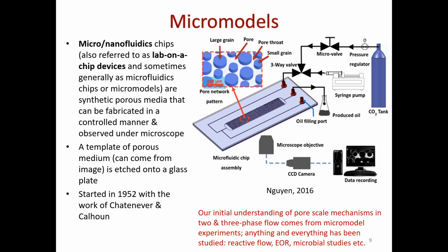It does take a moment to produce one. And you have to be in a clean room because these are very small sizes. The depth of the etching depends on how long you expose. And then you have to seal your micromodel on top. But altogether that could take about 10 to 12 hours. So if you're thinking of signing up for a research project like that, have that in mind. But then you can also produce multiple versions of it, right?